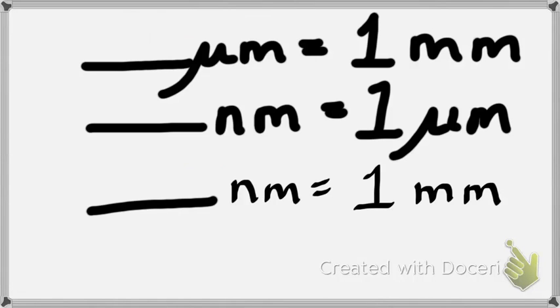So, guys, I want to talk to you about some other units of measurement. Some of you may have noticed these other units, and I want to show you some pictures where you may have noticed them. Would you join me in your lab manual on page 14? I know I pointed this picture out to you. For those of you that had your lab manual that day, page 14 were pictures of blood and blood cells with different microscopes. Do you guys see there's a little ruler at the bottom right-hand corner of each of those pictures? That's to show you the scale.